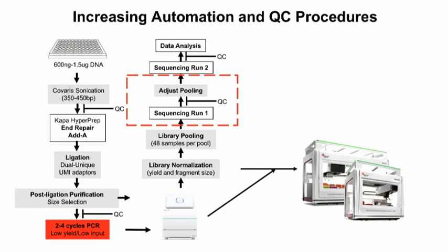very important. One of the things we also do with the dual uniques on this number of samples is we mix up the pairings. So we have 192 true dual uniques, but right now we have about 40 sets of those where we just switch up the pairs. And all that gives you is an ability to tell flow cell 1 from flow cell 2 to flow cell 40, right? It doesn't actually give you more dual uniques to work with, but it gives traceability in the laboratory, so you can have unique patterns of indexes on each plate as they go through processing, which, again, is an extra traceability step, QC check, et cetera.